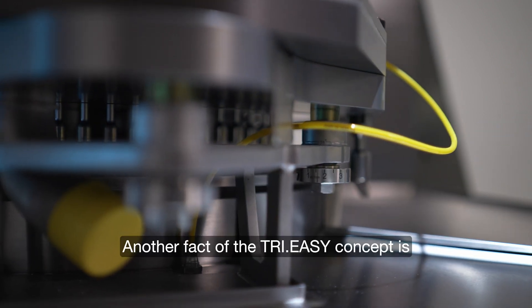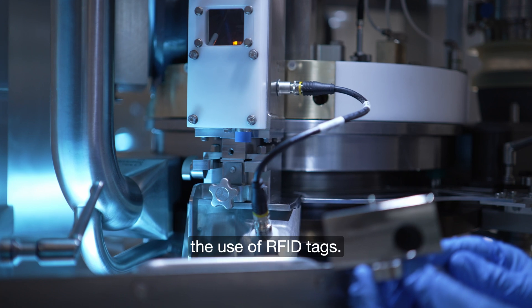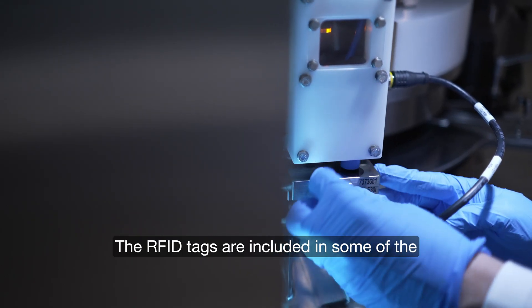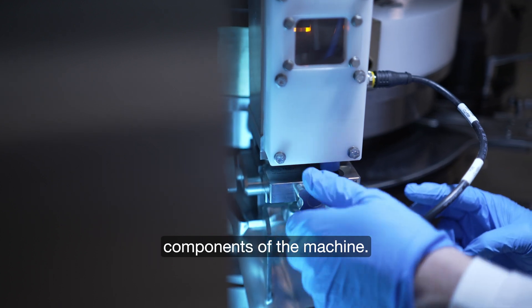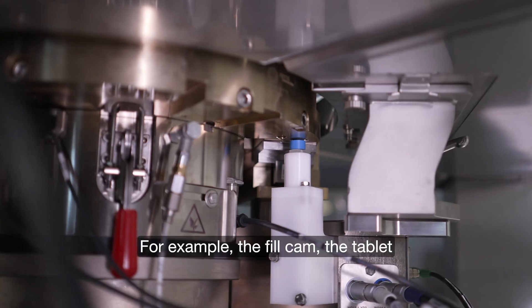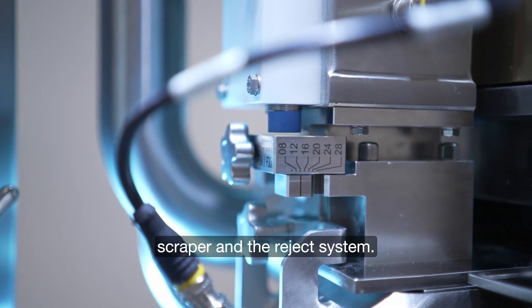Another feature of the Tri-Easy concept is the use of RFID tags. The RFID tags are included in some of the components of the machine — for example, the fill cam, the tablet scraper and the reject system.